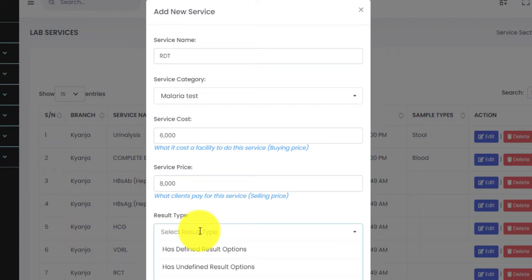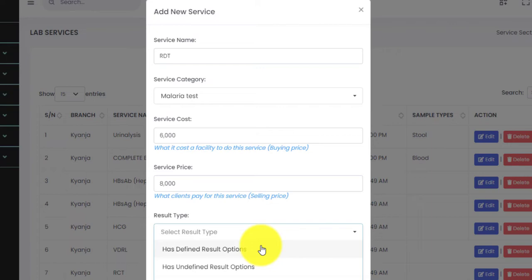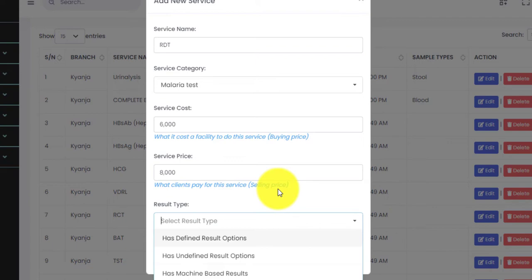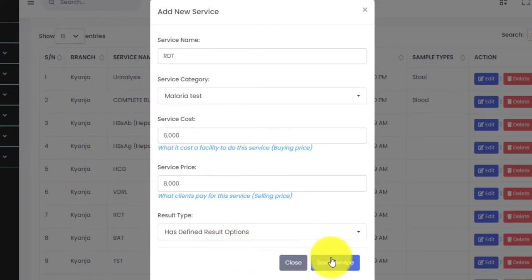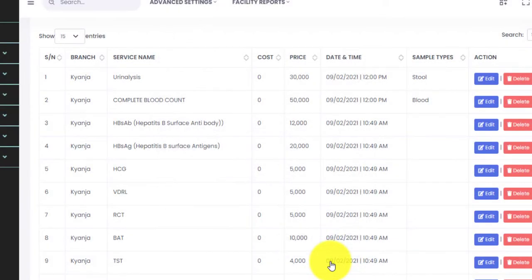Those with defined results are services where we know what to expect — like RDT, where we either expect positive or negative. In that case we select 'Has Defined Results'. Those with undefined results, like stool analysis, produce a descriptive result based on observation. Then there are those that read from a machine, those with parameters, and culture and sensitivity. Since we are entering RDT for malaria, which is positive or negative, we go with 'Has Defined Results'.